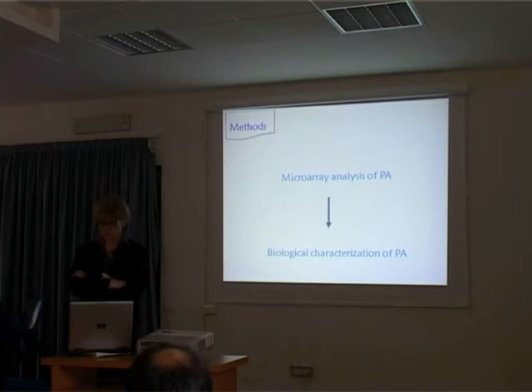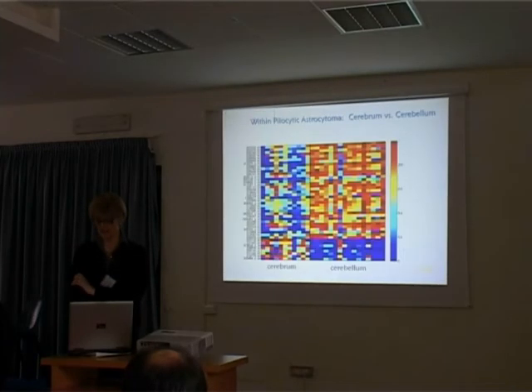So the microarray analysis was done on pilocytic astrocytoma for biological characterization.